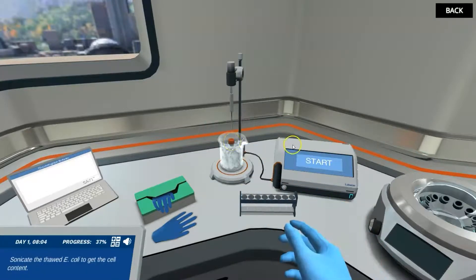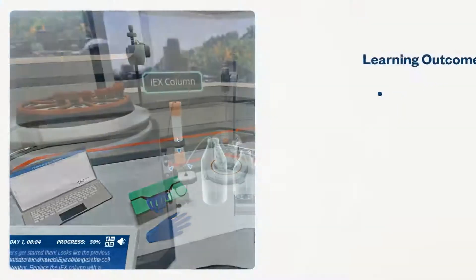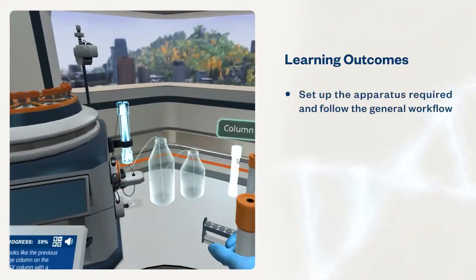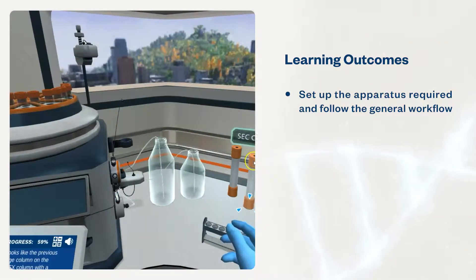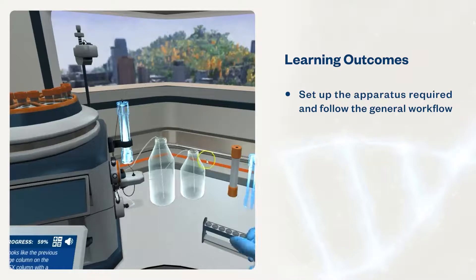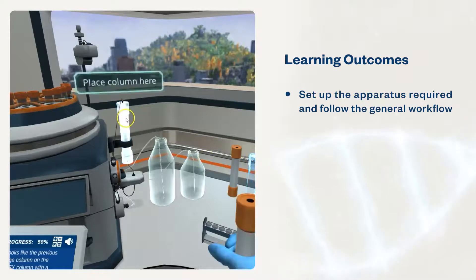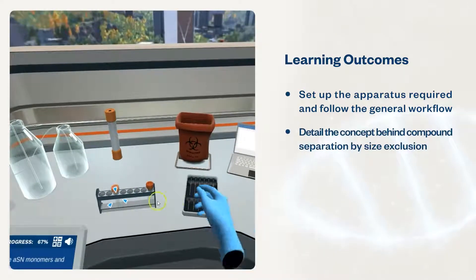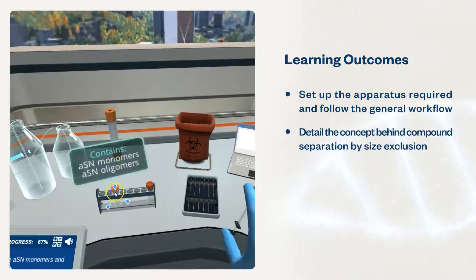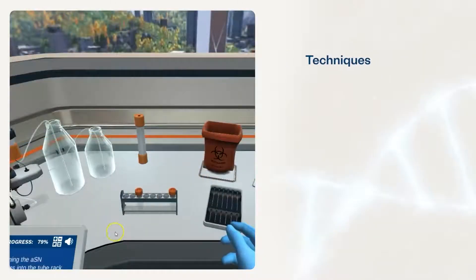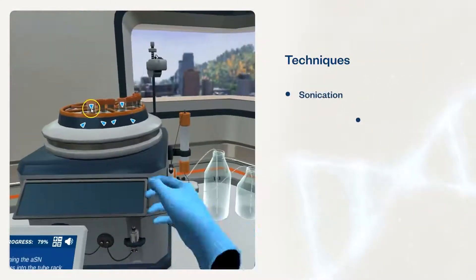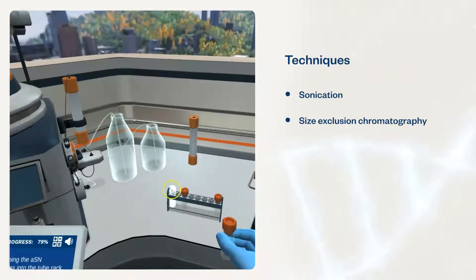These simulations will help students set up the apparatus required and follow the general workflow associated with liquid chromatography. They will also detail the concept behind compound separation by size exclusion, using techniques such as sonication and size exclusion chromatography.